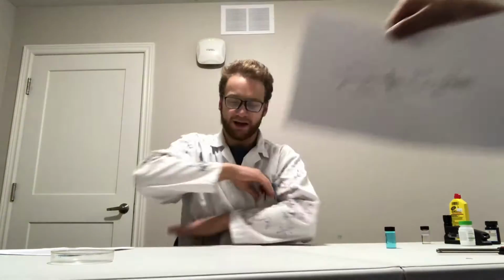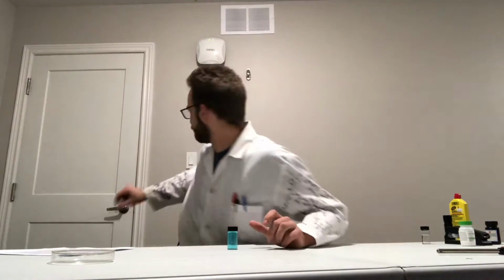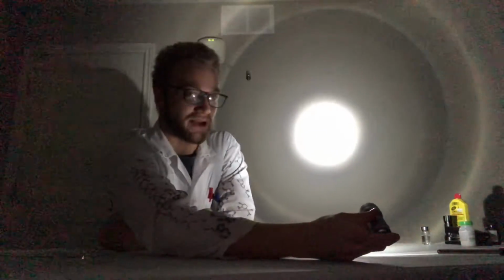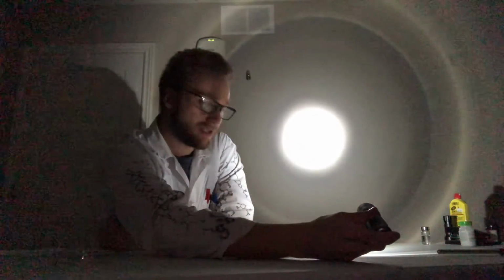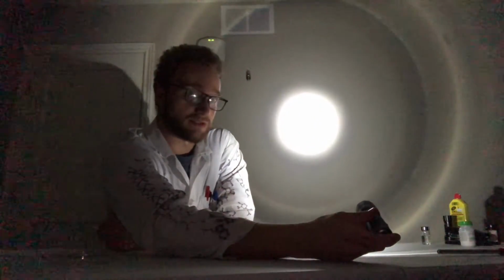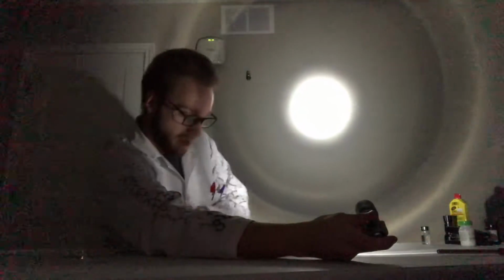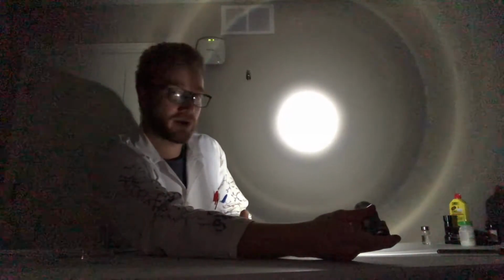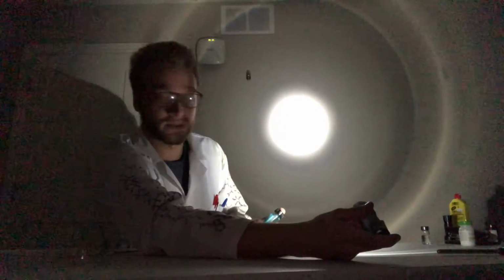Now, that's how a spectrophotometer works, but let's do a demonstration, because it's all good in theory until you can prove it. So, I have here a fancy-dancy flashlight. As you can see, the flashlight on the wall is pretty intense. It's like blindingly white. Now, imagine we were to put something in front of that light that would take away some of the intensity, perhaps absorb some light.